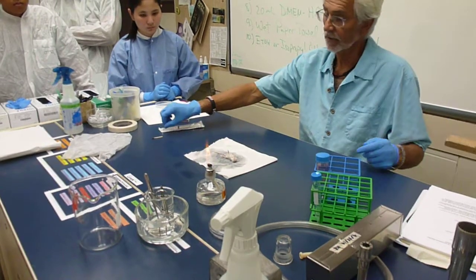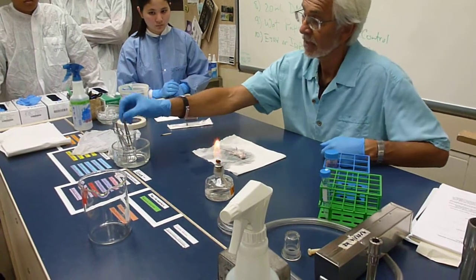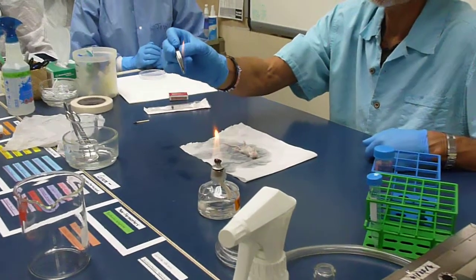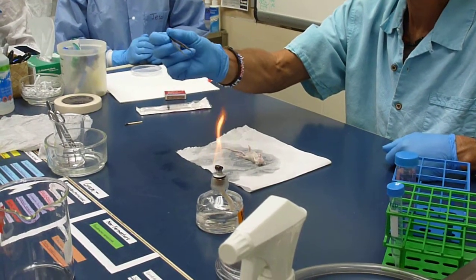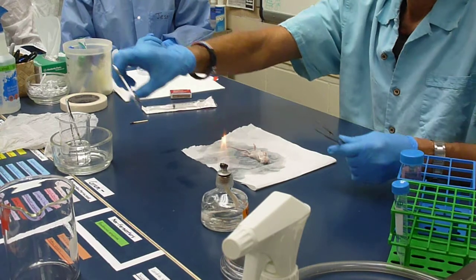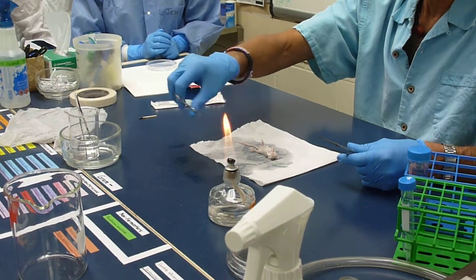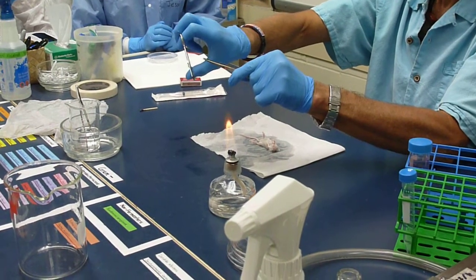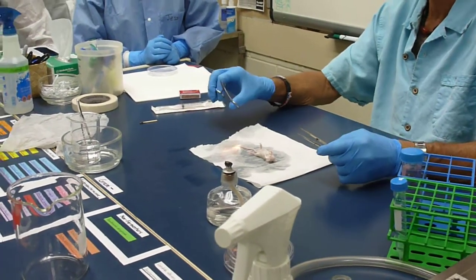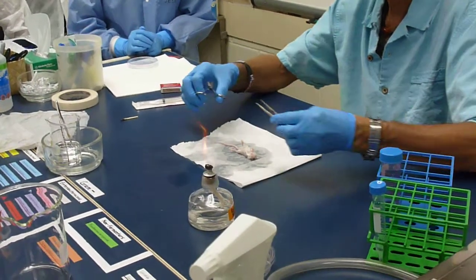You want a pretty clean work area and you want to avoid any kind of fire hazard. When flaming, you don't have to hold the instrument in the flame — just let the alcohol burn off. Don't make it too hot. With scissors it's a little tricky because fire can persist in that little area, and if you come down and hit the mouse with fire it'll start burning — that's why the paper towel is there.